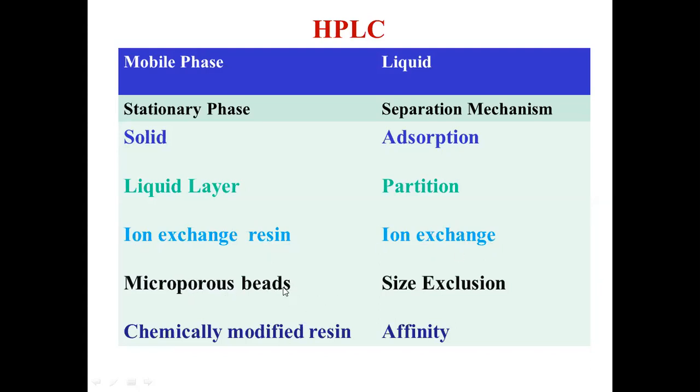And if we use microporous beads, they will have their pore maze, and into the pore maze the molecules are able to penetrate rapidly. Whichever solutes have lesser size, they will penetrate into the pore maze, and whichever solute molecules are larger in size, they are not able to penetrate into the pore maze. So it is just like a process of filtration, a sieving, molecular sieving. You have a sieve in your house, so the sieving process is done based on size.